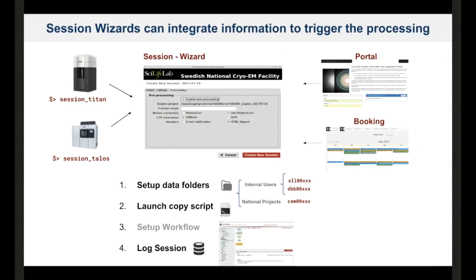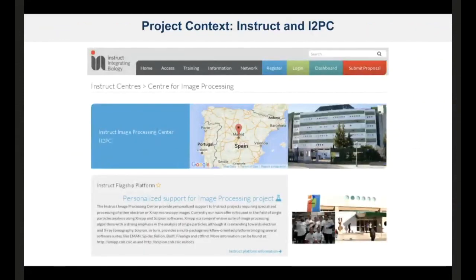In Madrid, for example, they have also created some kind of web interface where you do similar things and set up the processing project. This project, one of the main goals also was to provide infrastructure and access to the state-of-the-art algorithms.